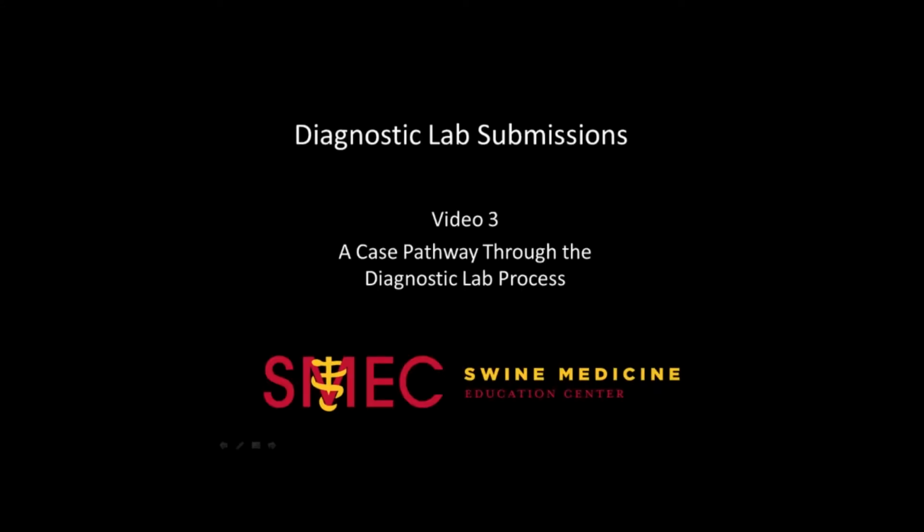Welcome to the SMEC Veterinary Diagnostic Lab Video 3. This video will describe what happens to your samples as they are processed through the diagnostic lab.